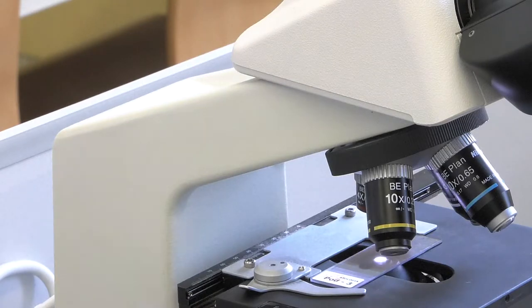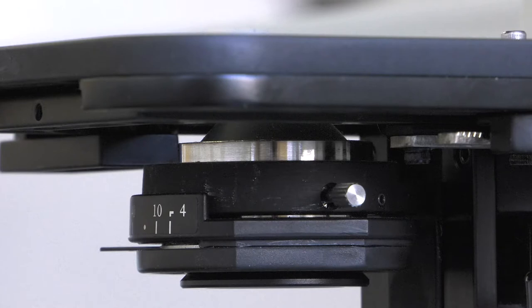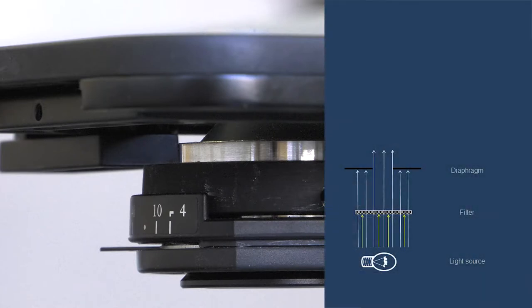The condenser is the first one of the three lenses of a conventional optical microscope. This lens does not magnify the image. Its function is to condense the light from the lamp and project it through the sample.